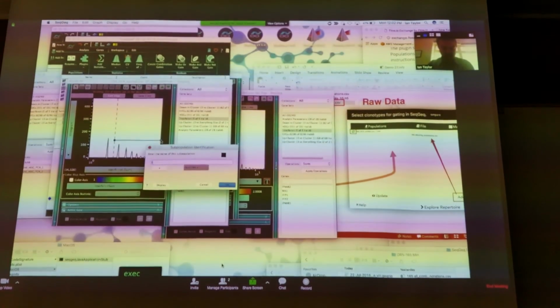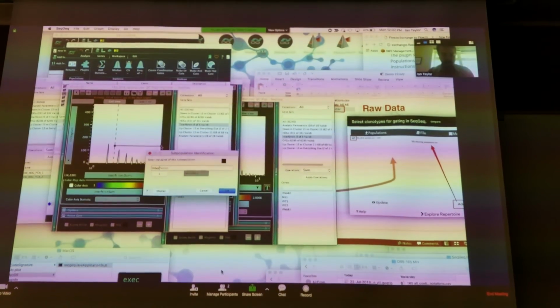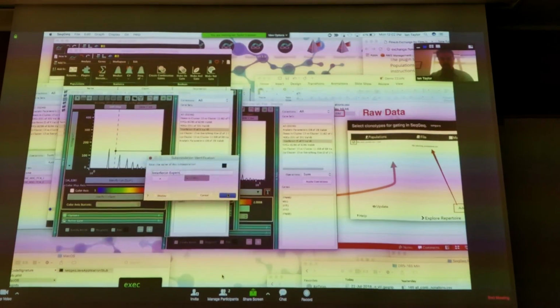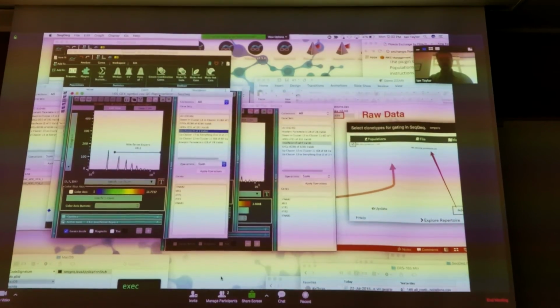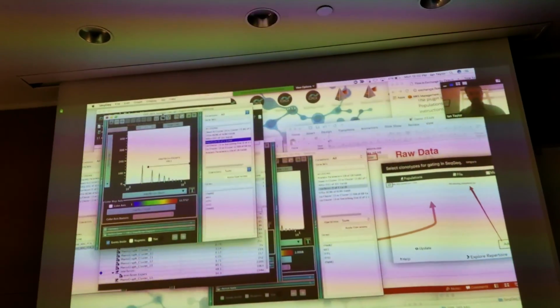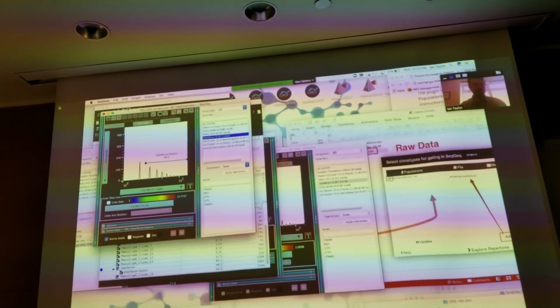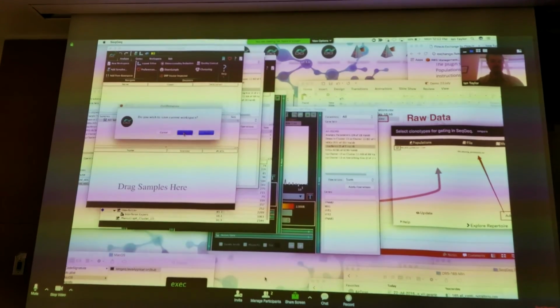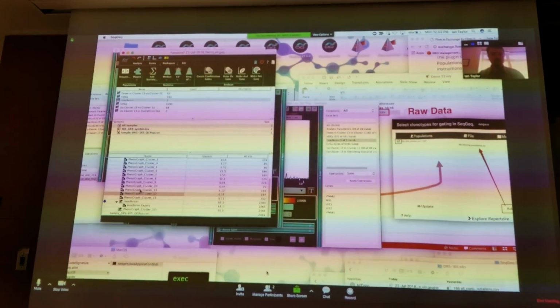Okay. Right, so those with high versus low interferon. Good. Chop that up into different levels too, right? You've got 5 or 6 different distinct populations. That would be good to get the ones, even if you move the gate a little further down, so you get the really high versus really low, and then do the VDJ versus one versus the other.